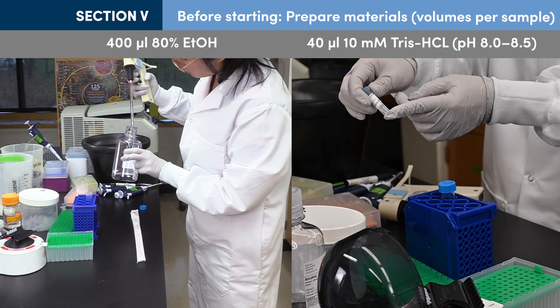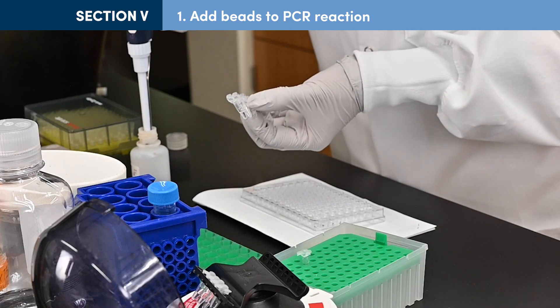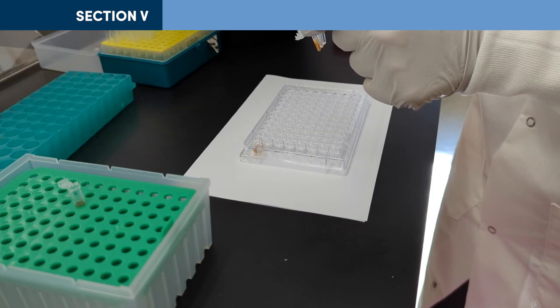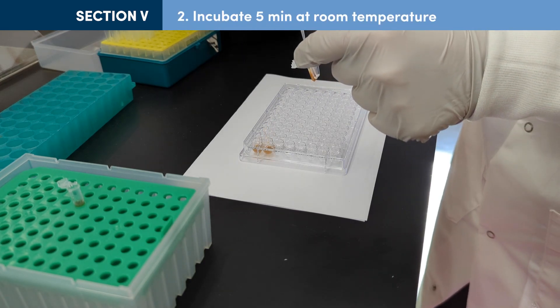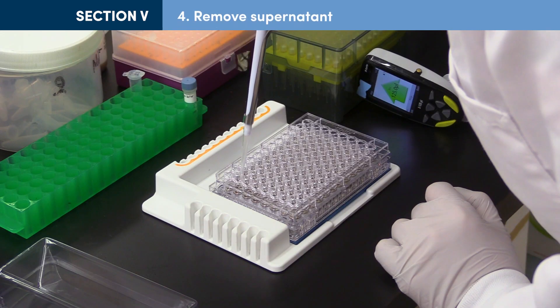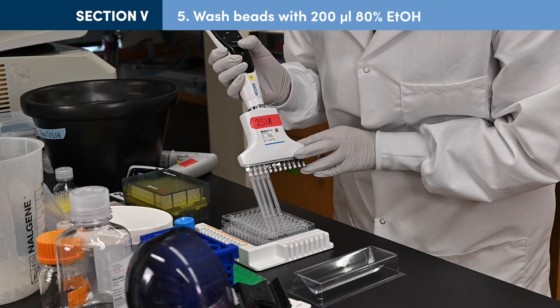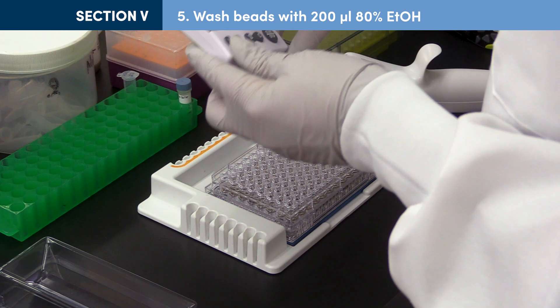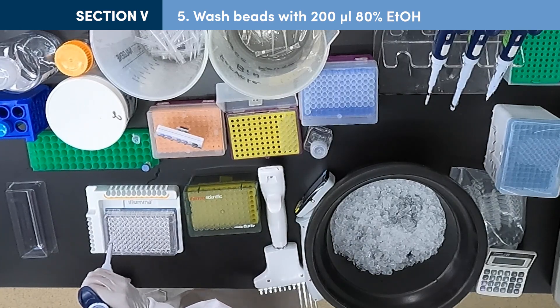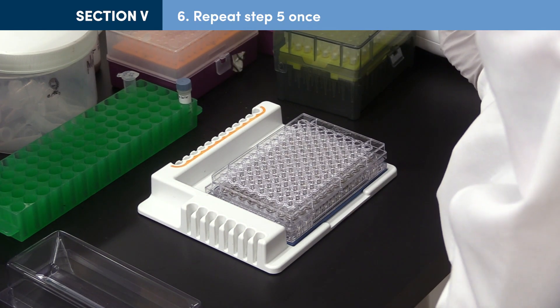Prepare fresh 80% ethanol and tris chloride. Resuspend room temperature Ampure beads by pipetting up and down or inverting, then add 50 microliters of resuspended beads to each 50 microliter PCR reaction. Mix well by pipetting up and down 10 times, expelling all liquid out the last time. Incubate the beads at room temperature for 5 minutes or longer, then place tubes on a magnetic stand for 5 minutes. Carefully remove and discard the supernatant, removing as much liquid as possible without disturbing the bead pellet. With the tube in the magnetic stand, slowly add 200 microliters of 80% ethanol to each tube. Incubate for 30 seconds, then carefully remove as much supernatant as possible without disturbing the beads. Repeat for a total of 2 washes, then again remove as much liquid as possible.